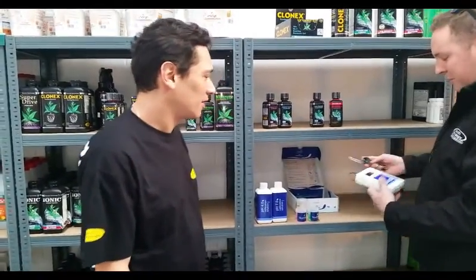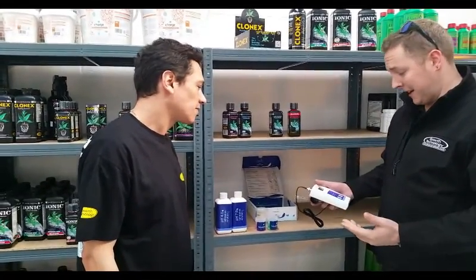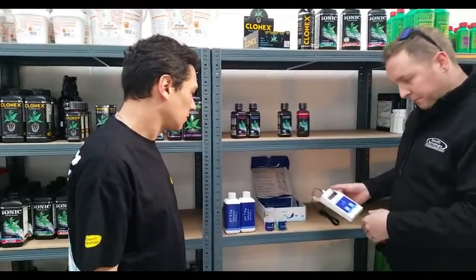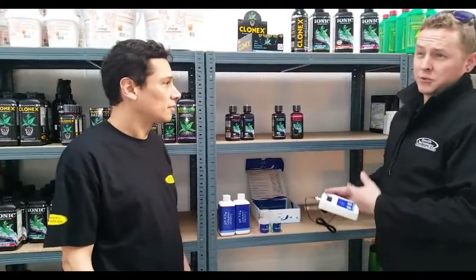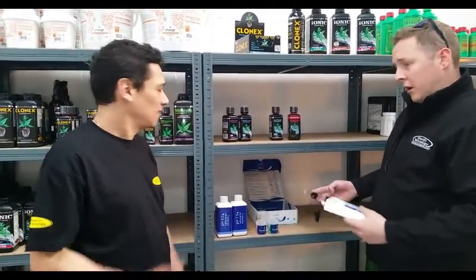We've got the Bluelab pH meter. All of Bluelab's products calibrate exactly the same. It's a two-stage calibration — we calibrate to seven and then we calibrate to four, which means we get the most accurate reading possible from two points.